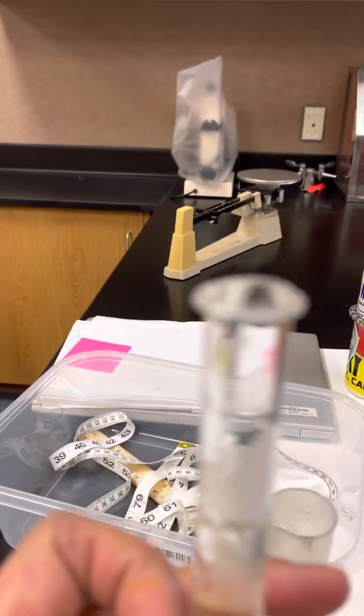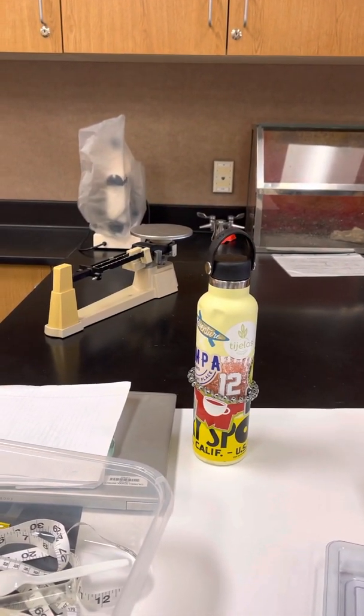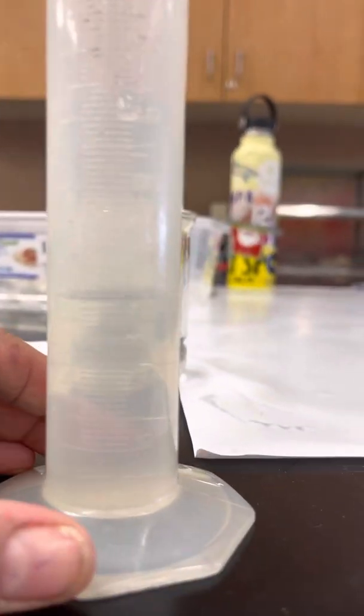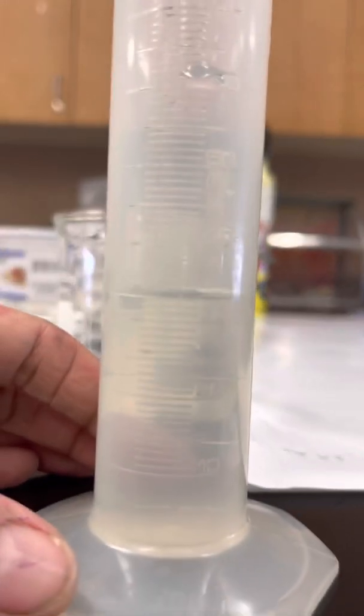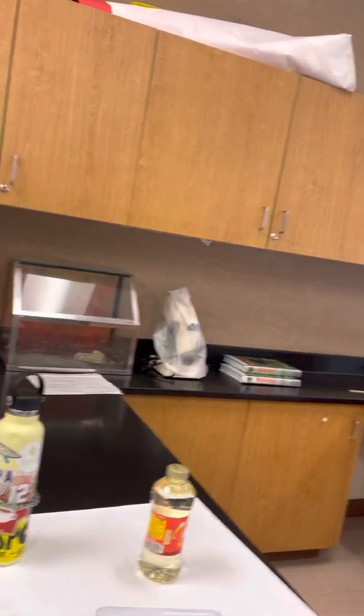So I filled it up to the top, and I want to figure out what volume it's holding. I spilled a little bit, but here we go. I'm going to put it right here. About, there's 10, 20, 30, 31, 32, 33, about 33.8 milliliters. Okay, so that was that one, and then a plastic spoon.